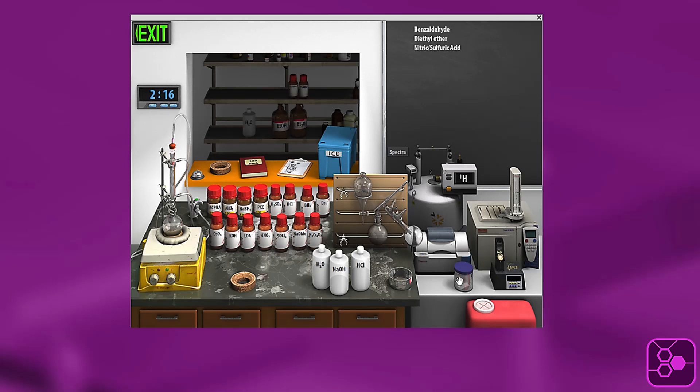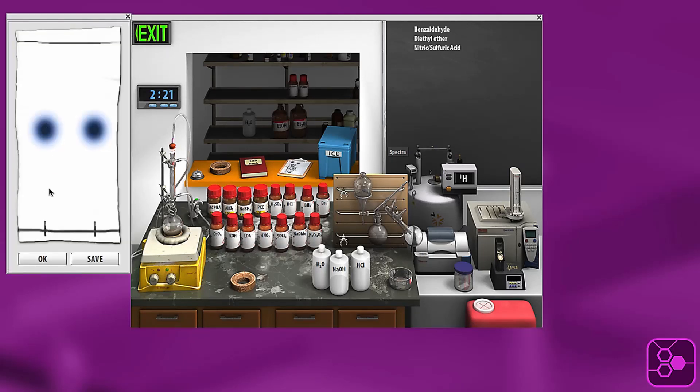So in order to perform a TLC you'll just come over here to the TLC plate folder. You click on it and drag over a TLC plate. So I haven't begun the reaction yet and you'll see that. In the left lane you have your starting materials and in the right lane you have whatever's in your flask currently as it reacts. You can see that because the reaction hasn't started we have all reactants to start and we still have all reactants.